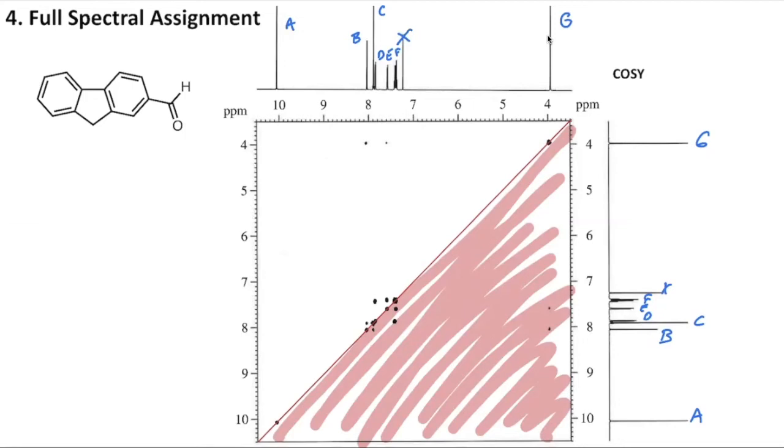So I'm just going to try to start at this top corner and draw a line straight down, trying to get that as matched up as I possibly can with the straightness of that axis. And then I'm going to just cut this and move it over so that we can start to line it up with some of our cross peaks. We can see that if we follow this down here, this is the AA self-identity.